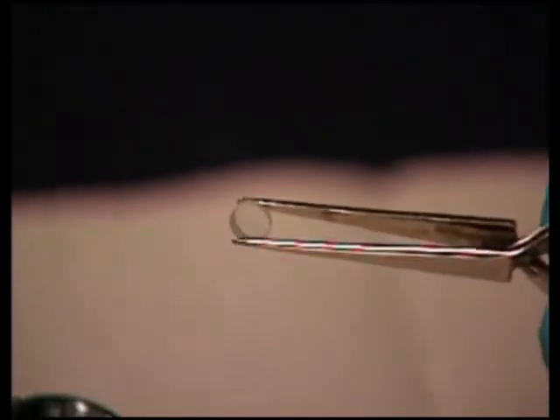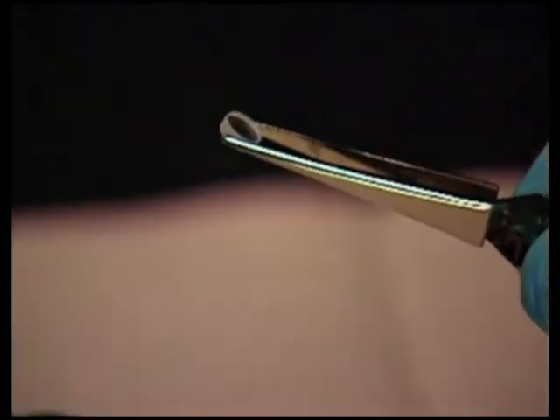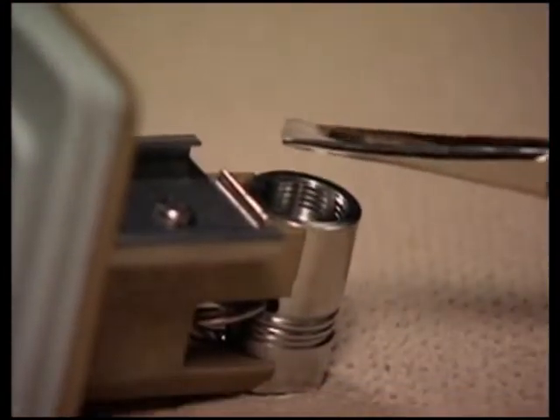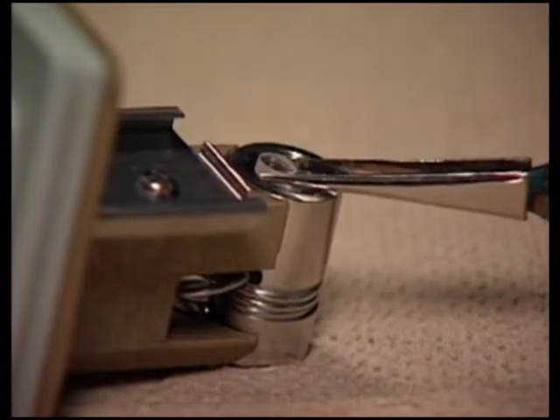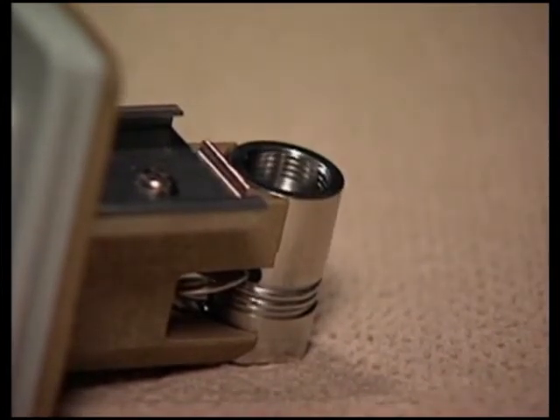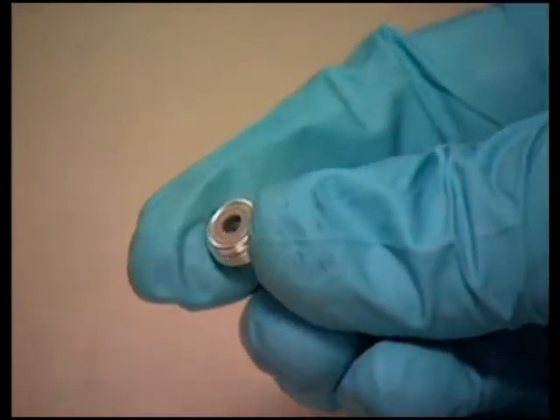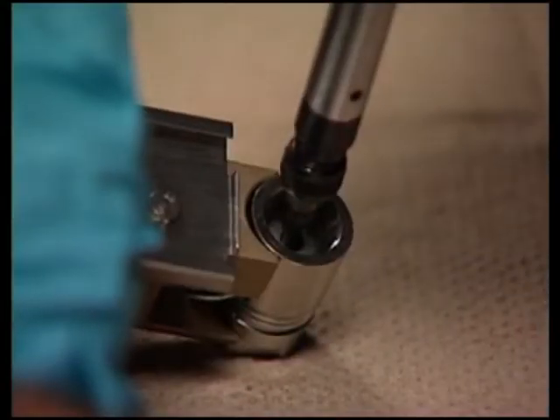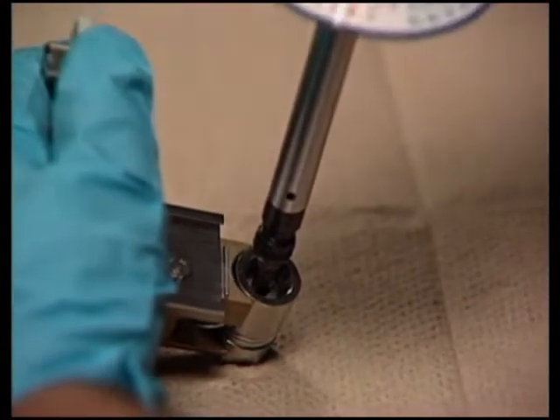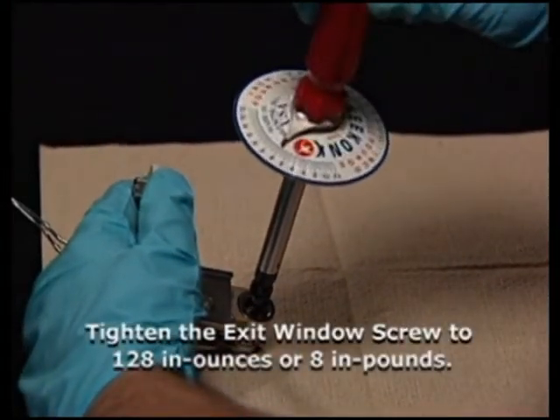Inspect the exit window for cleanliness. If necessary, use nitrogen to clean the exit window. Place the exit window into the flow cell body, making sure the outside diameter of the window lies inside the counter bore of the flow cell body. With the tan colored portion of the window screw facing the exit window, use the torque driver to tighten the exit window screw into the flow cell body to 128 inch ounces or 8 inch pounds.